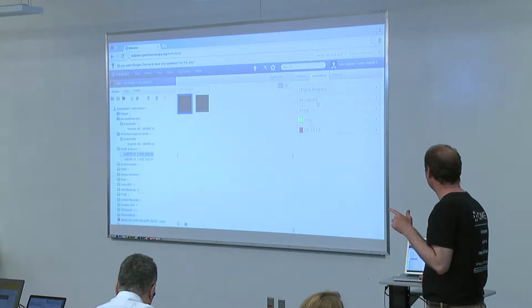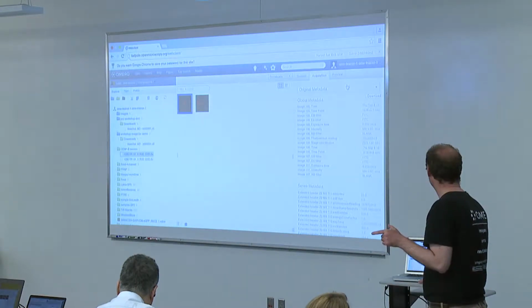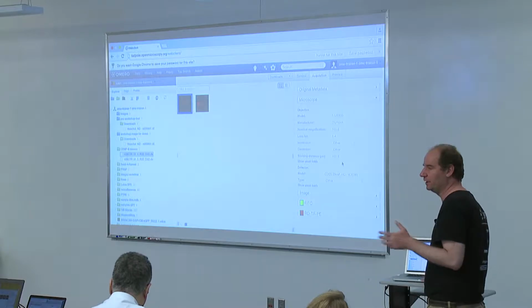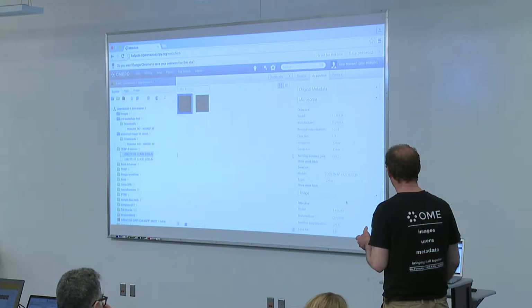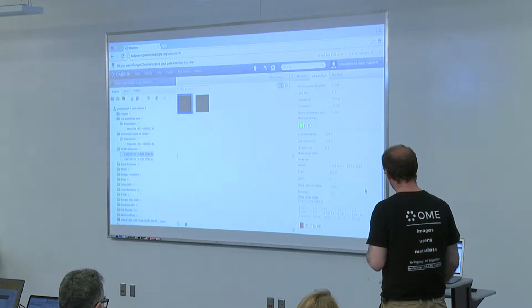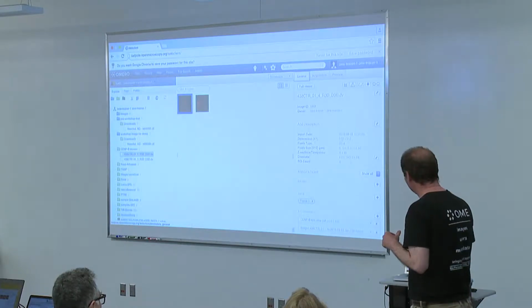But we don't actually change these ones either. We just read them and put them nicely into another tab so that you don't have to trawl through this. So you can open the microscope tab, and the metadata are being read from the original ones only, in a nice manner and respecting our model. So this is how you recognize them. Here is your microscope, your pinhole, and so on. Immersion, well, you can have that. The lens numerical aperture was there, so we read it. Yeah, no problem. That's how you get the overview. And once more, this is the original, and this is what we read. But we don't change these ones either.